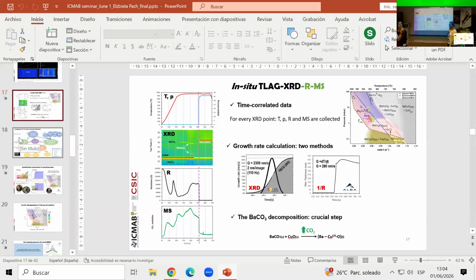In principle, it has been a quite complex way to mount the contacts, with titanium gold contacts, which don't have the YBCO on top. So we have pads which we can access after the deposition of the layer.